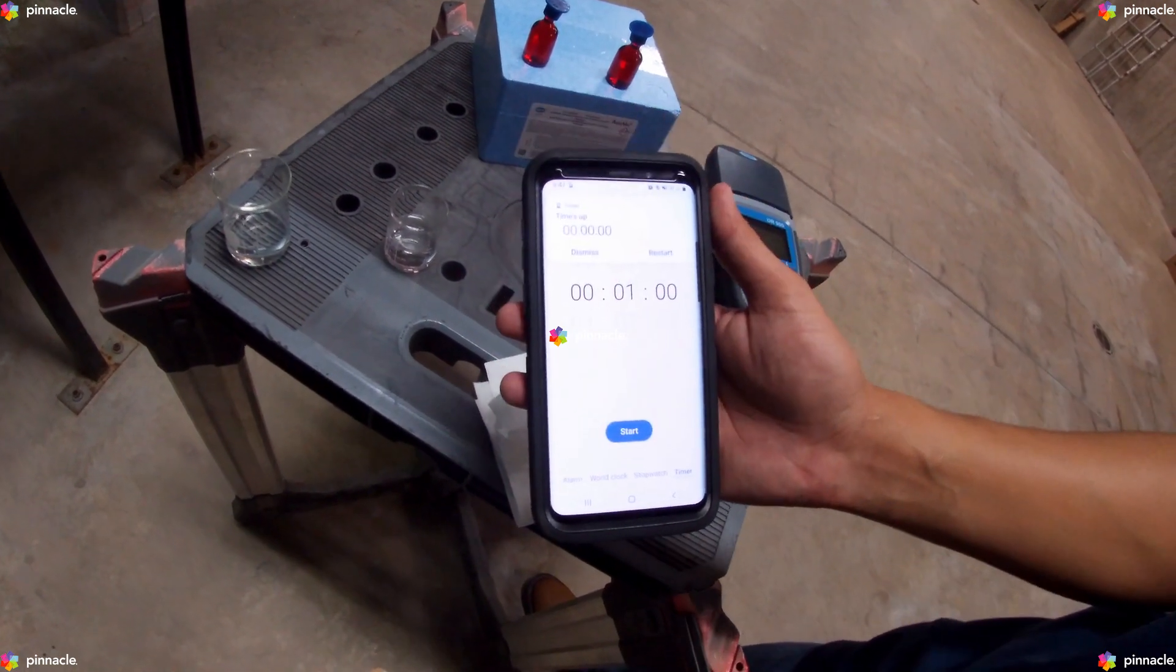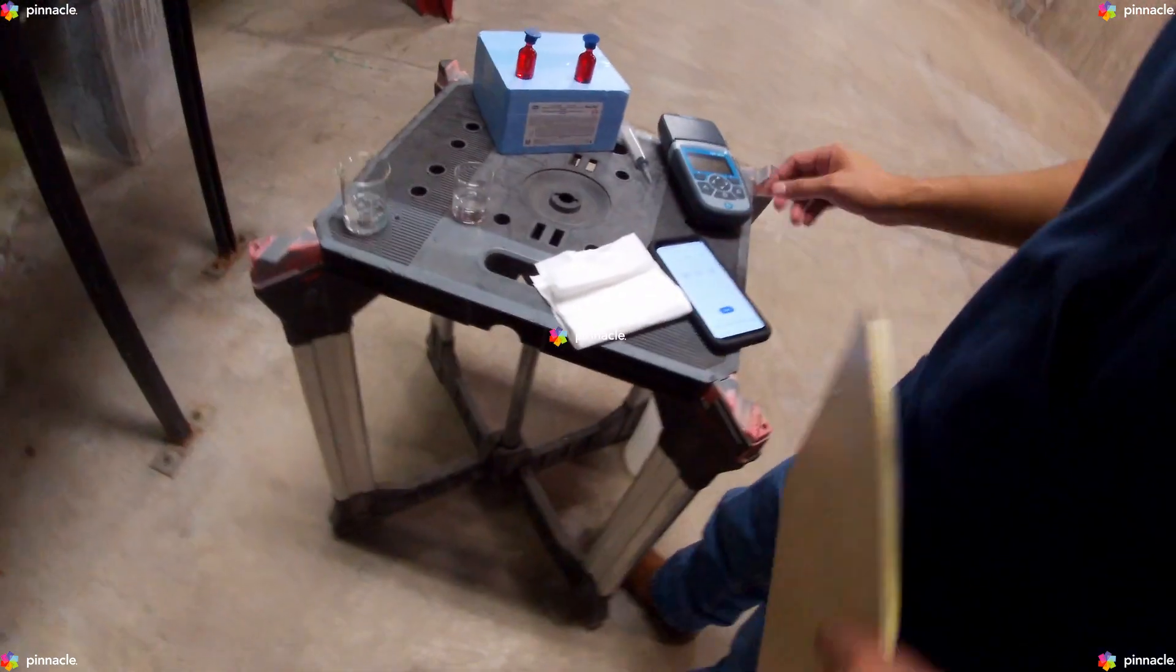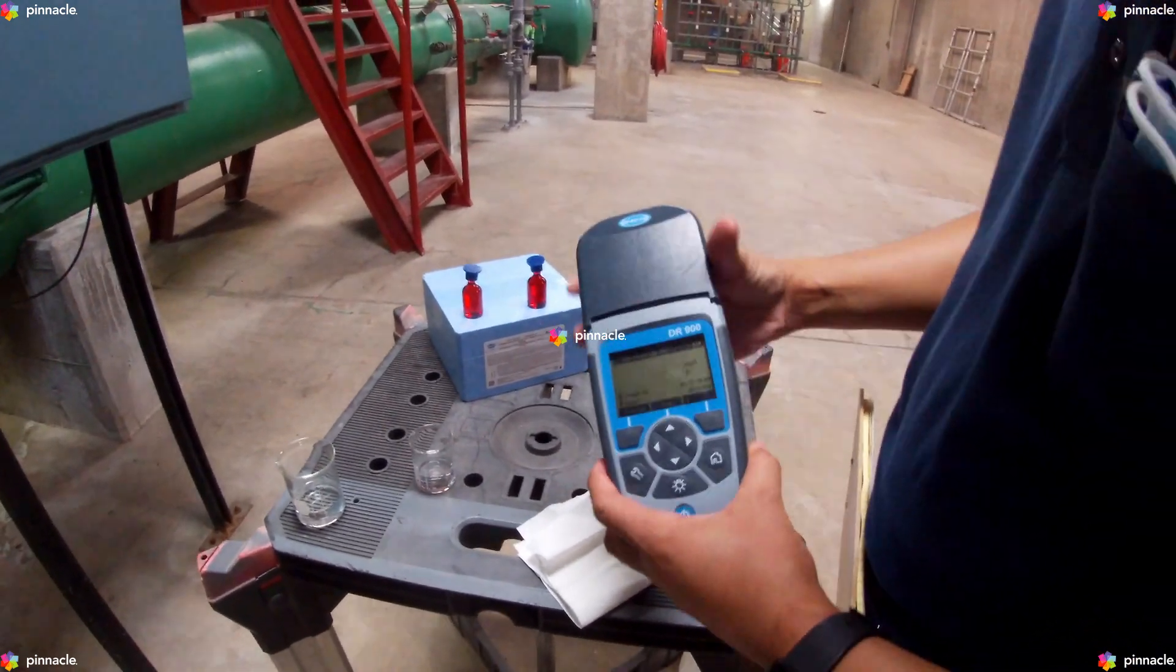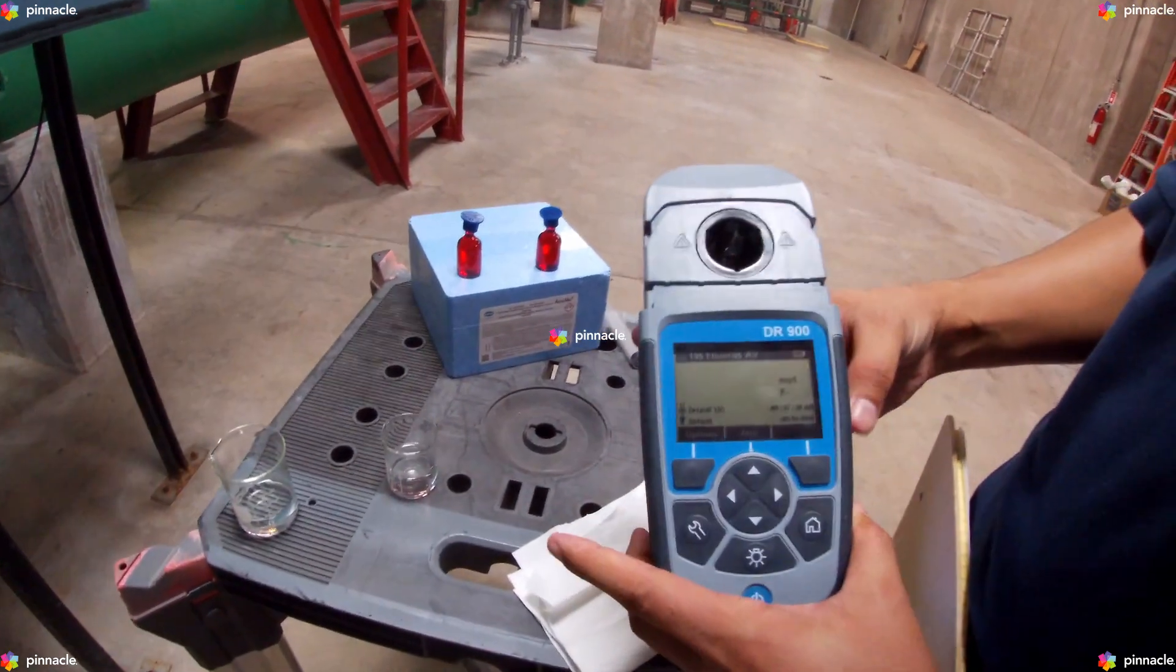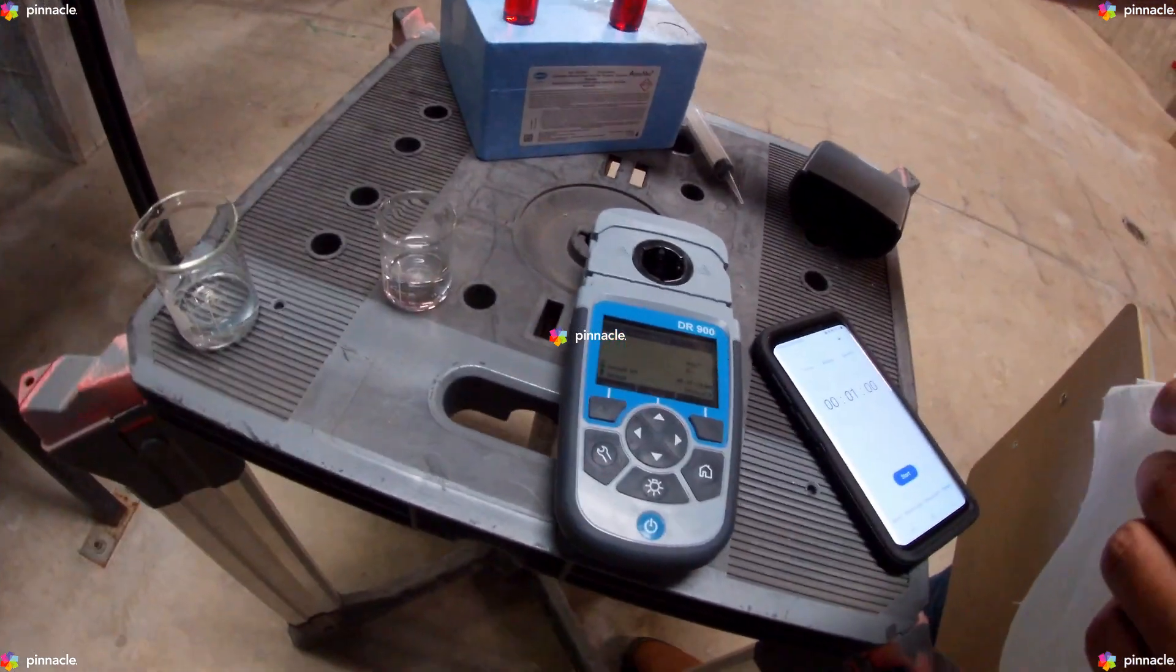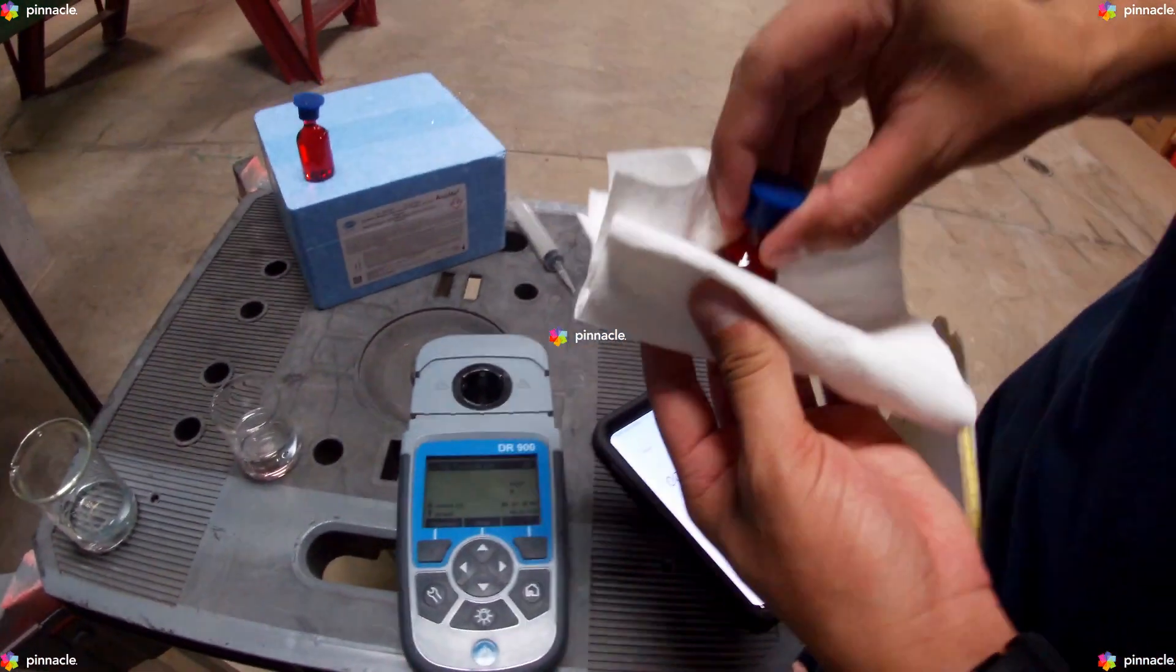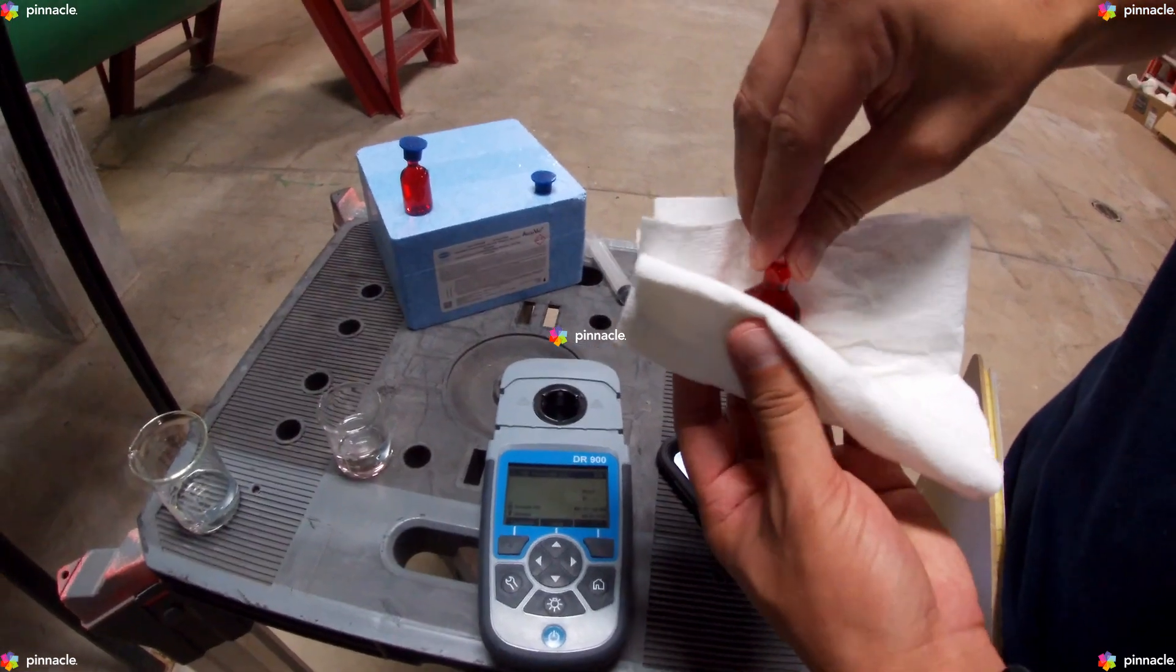When the timer expires, we will then grab our DR900 pocket colorimeter and make sure it is on. Next, we will grab our blank AccuVac Ampoule and clean it thoroughly.